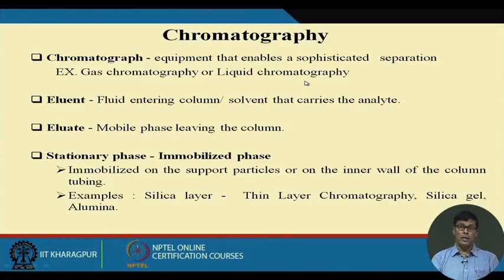The basic difference between gas chromatography and liquid chromatography is that the mobile phase in gas chromatography is a gas. So we use gas as a carrier, because when we inject the sample, it vaporizes. If it is a gas, that gas will remain in the gas phase, but you have to have a carrier gas. That carrier gas will take the sample through your column, where the separation of different components present in the gas mixture takes place. Then it goes to the detector, where we can detect the components.